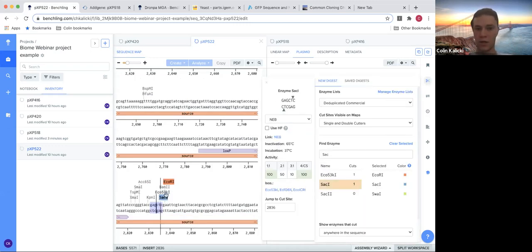So as you see here, and Ethan had this question earlier, why do you have so many restriction sites all clumped together? And what we call those are multiple cloning sites. And you can see obviously why it's good to have, because depending on what you're trying to do, it allows you to have a great range of ability to choose your restriction enzyme, how you're gonna insert this, so on and so forth.